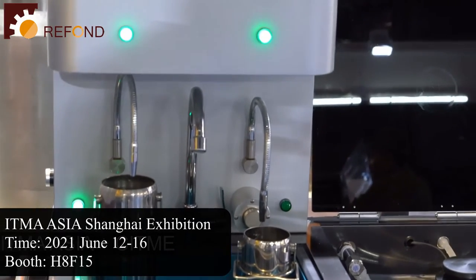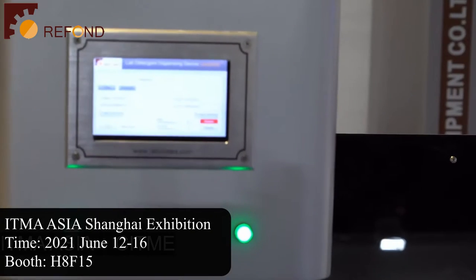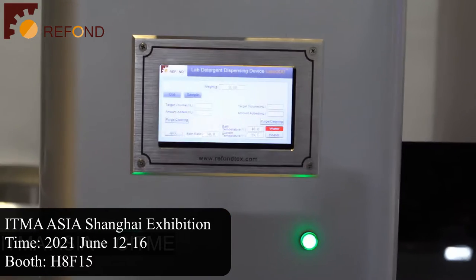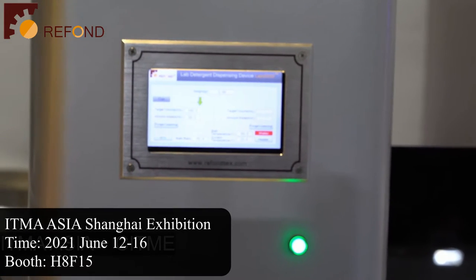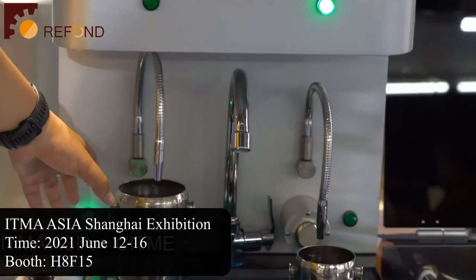And also on the touch screen, you will see that the cup is ready. Now you can put a sample onto the balance. It will automatically measure the weight of the sample and then pump the predetermined amount of detergent into the test container.